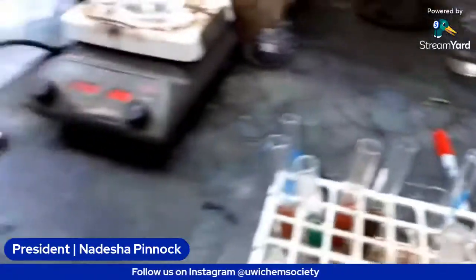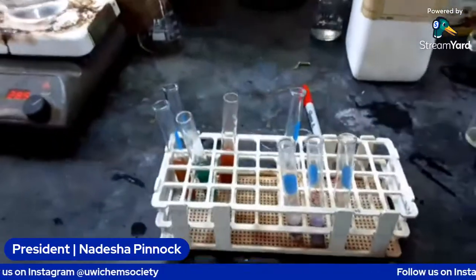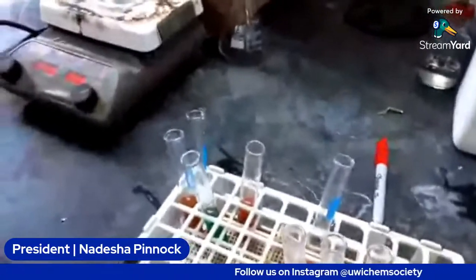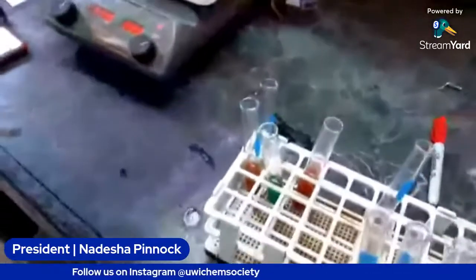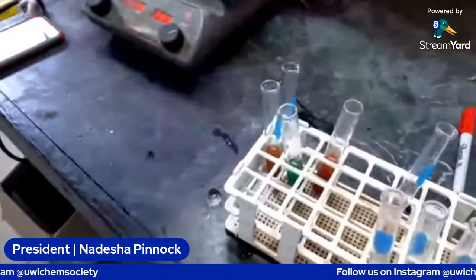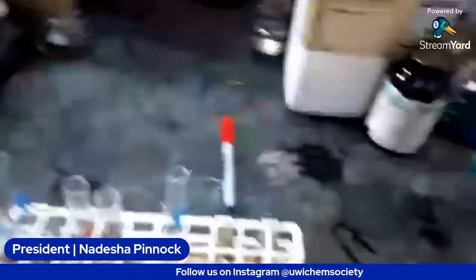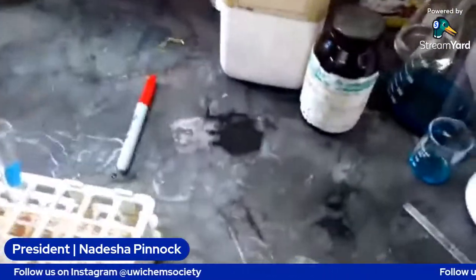So I guess we're going to run those again while we're doing the other test, that is the iodine starch test, for which for some reason I forgot to prepare the reagent. But while we are doing the theory for the test, I will go ahead and try to prep it in the meantime.